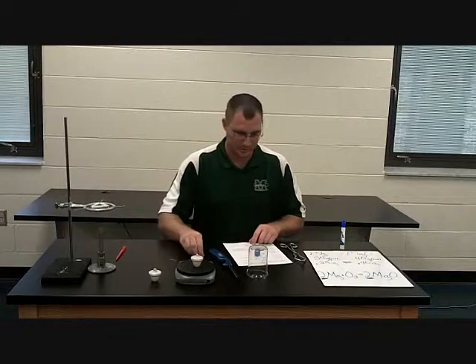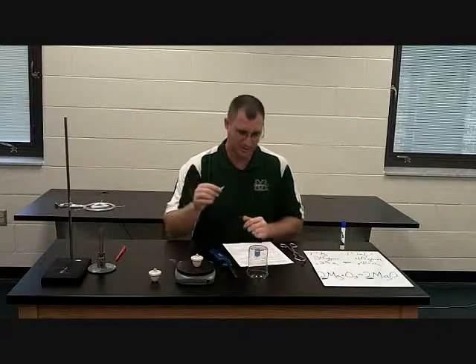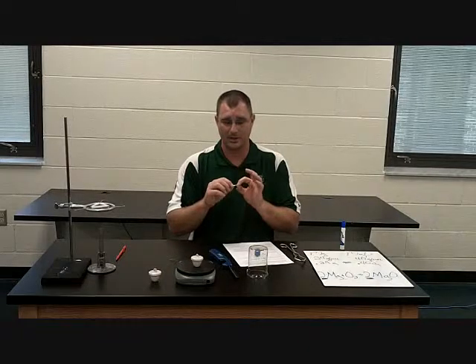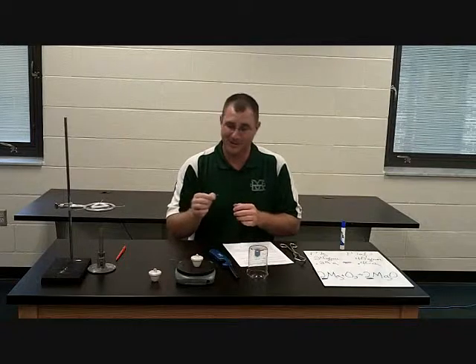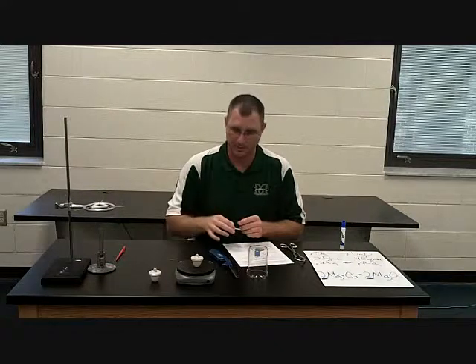So the first thing we want to do is take a little piece of magnesium, and we're going to look at some of its qualitative properties. And again, quantitative deals with numbers, qualitative is just the descriptive things. Okay, so I can see it's silver, it's shiny, it has some luster, it's kind of light, it's a solid at room temperature. A lot of my students said it was a metal, but I thought that was kind of pushing it. They didn't know it was a metal. I think that's more of an inference, but that's what they had for some of their qualitative properties.